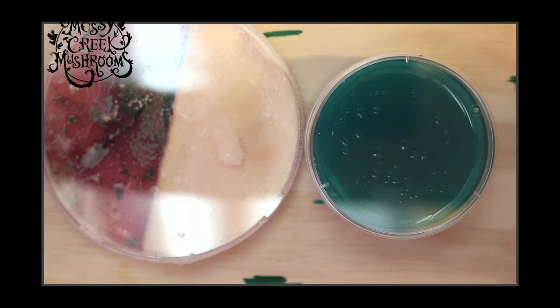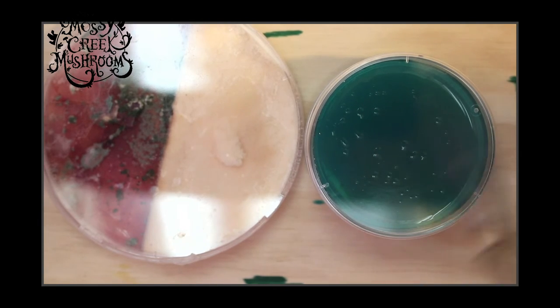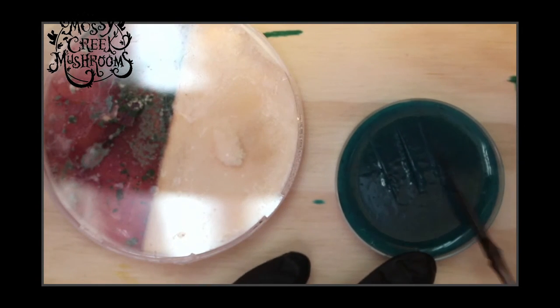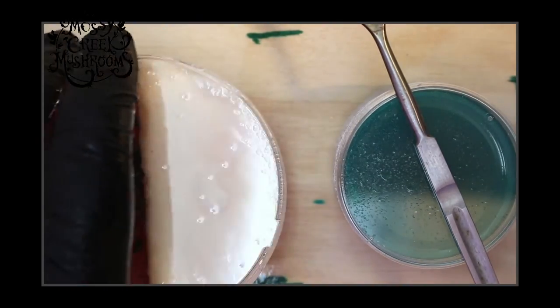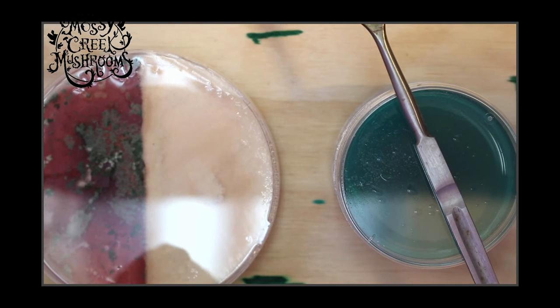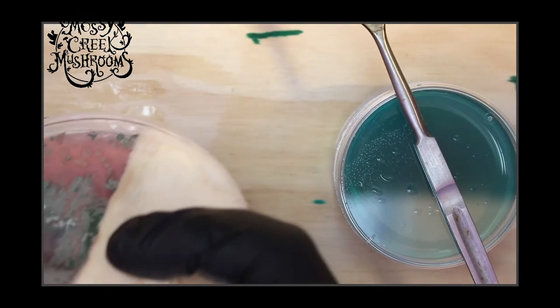Let's get some lab ASMR going. Nice red hot blade — we're going to cool that in the agar. We're going to coat this plate in alcohol. I am not expecting that to sterilize anything — that is sanitizing. Another reason why I use as much alcohol as I do is because a wet surface is not a surface which mold is just flying off of. If it's wet with a sanitizing agent, you're going to be a little bit safer.